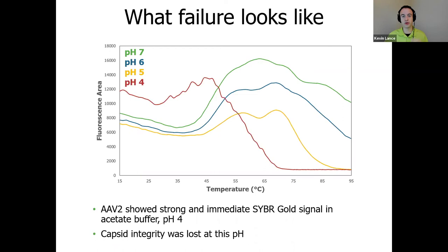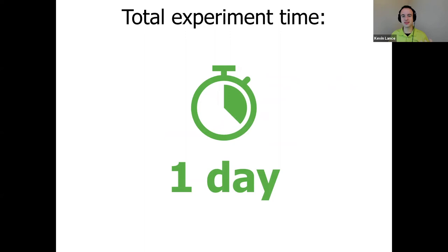And lastly, I do want to emphasize that all of this data could be gathered in just one day, with a few hours on Big Tuna, a few hours on Uncle, and then combine that with a second overnight on Uncle, and you can get everything done in less than 24 hours, which is pretty amazing considering it equals about one Nature figure. So quite proud of that experiment.